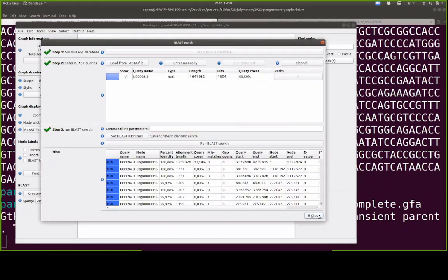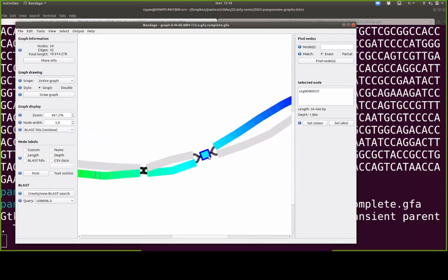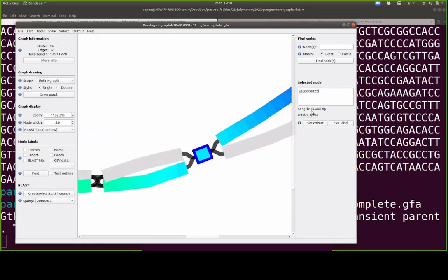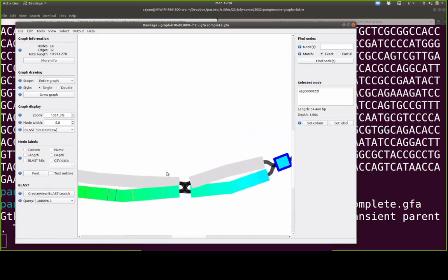I'm sort of surprised that it's fast. Me too. I don't know. Alright, so you got your K12 path and you see it's mostly separated except for some region here. You've got the 34 kb region common between K12 and O157 in minimizer space, but it becomes just one node. Sometimes it doesn't happen and we just add these connections.